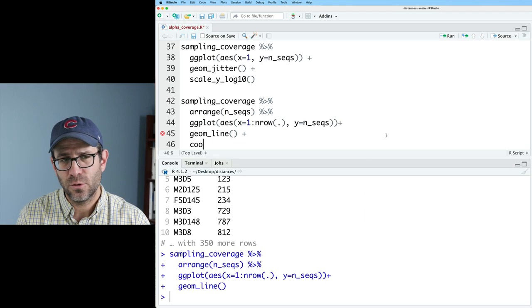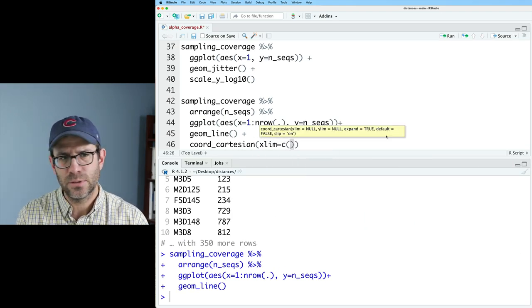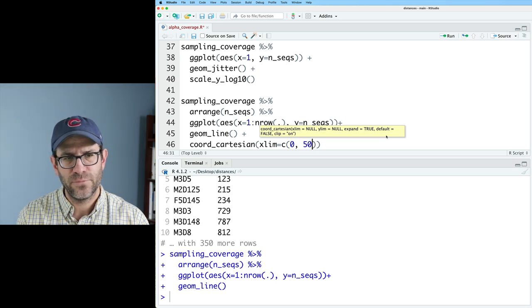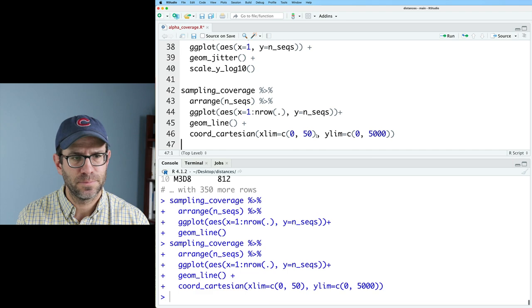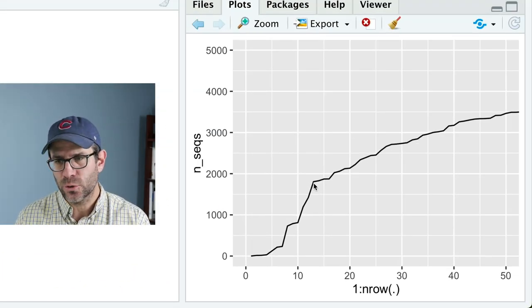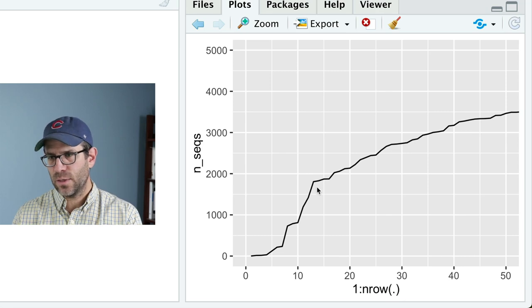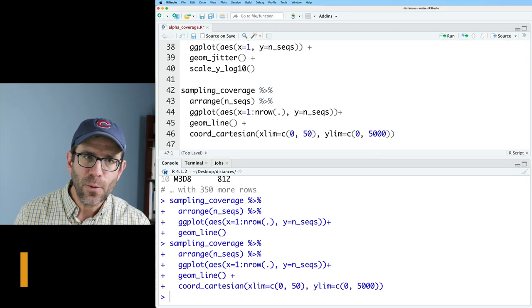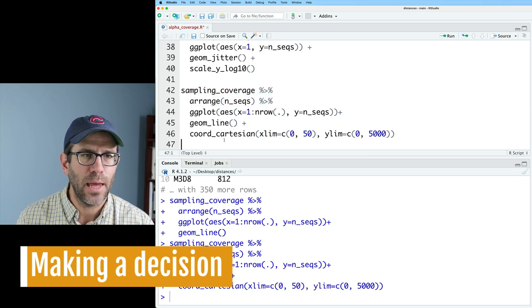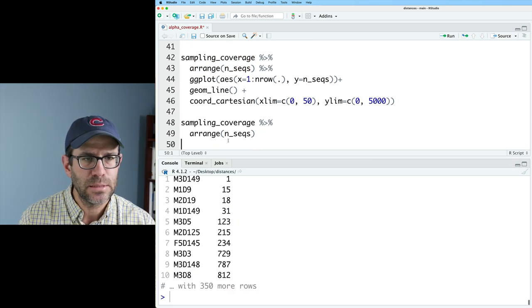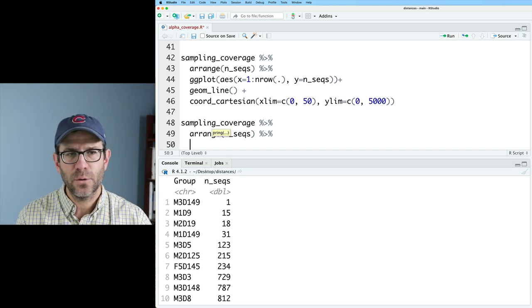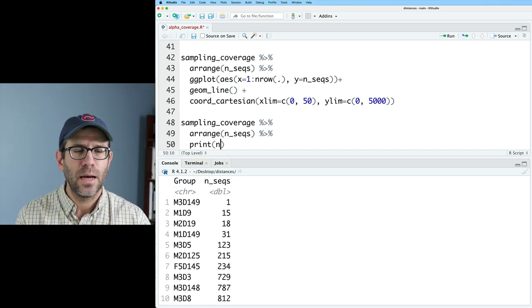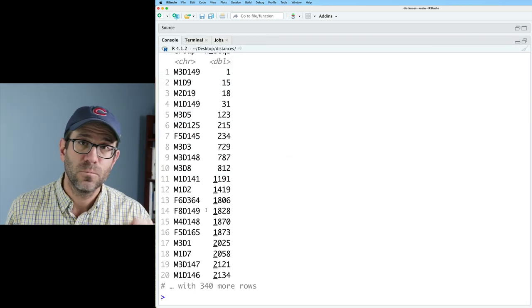And I could do coord Cartesian, xlim, let's do 0 to 50. And then for my ylim, I'll go from 0 to 5,000. And so again, right about there is the shoulder that I see. And that's at about the 13th sample in. So one thing we might do then is come back to this pipeline where I had sampling coverage, arrange nseqs. And I can then see the first 10. But then I could pipe that to a print, let's do n equals 20.